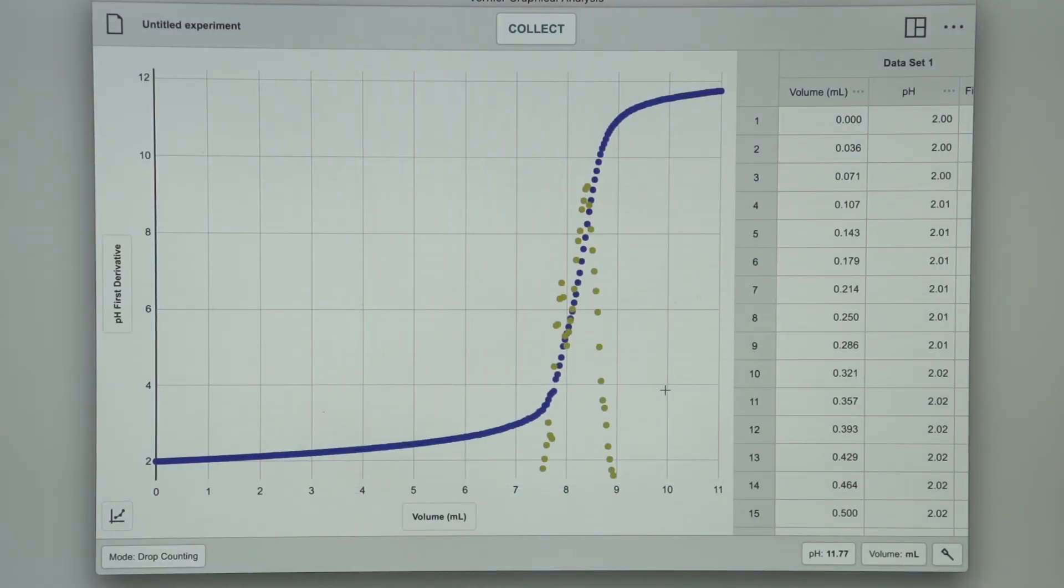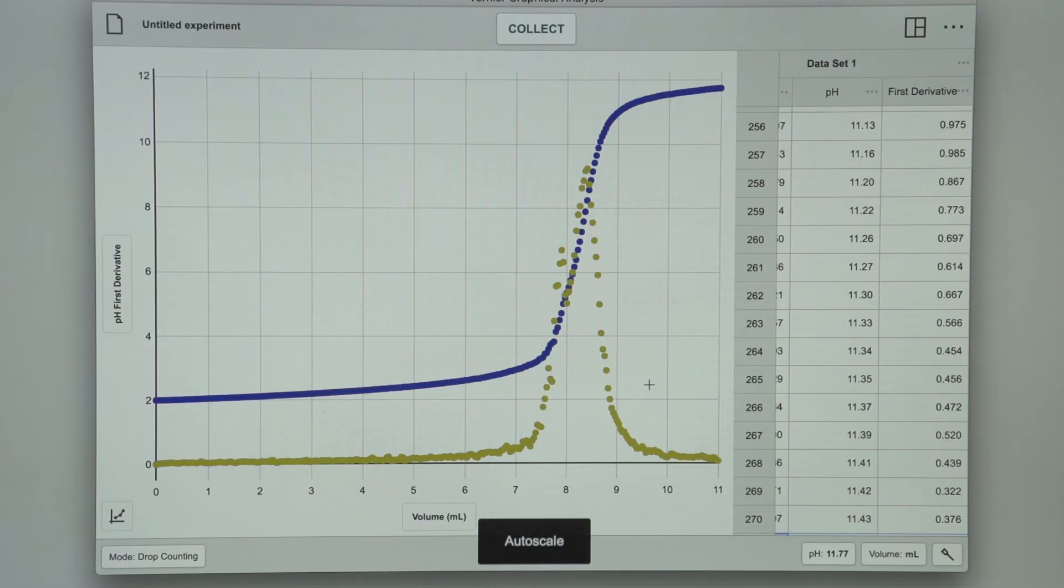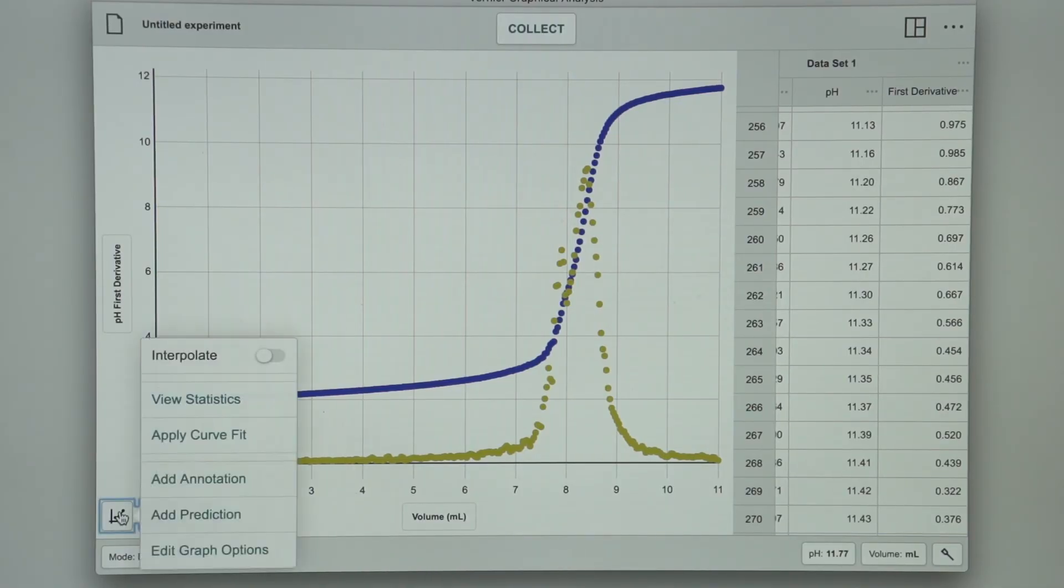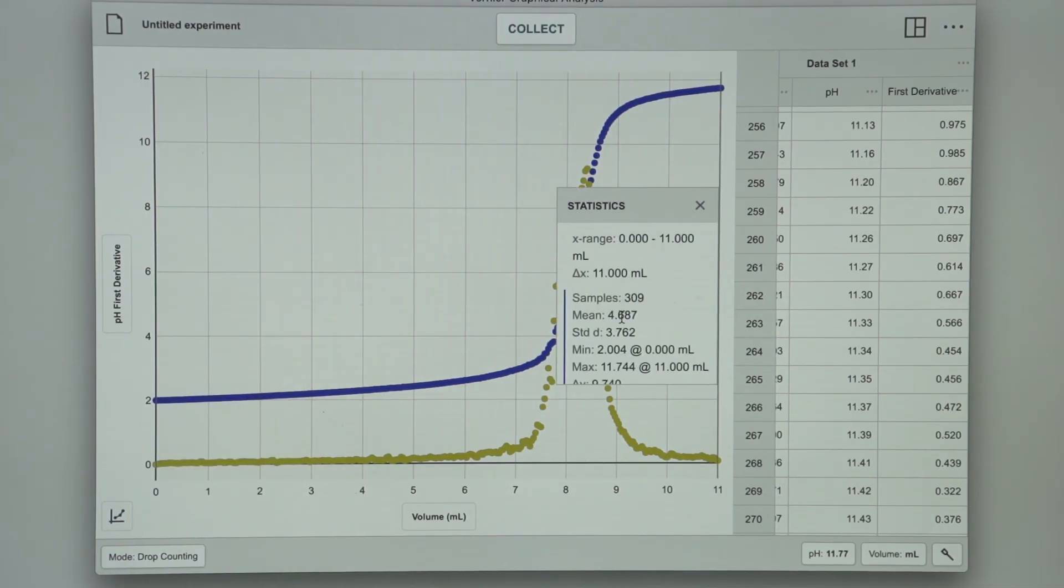To auto-scale, double-click anywhere on the graph. Now, to get the volume where this peak of my first derivative happens, I can use the Statistics feature in Graphical Analysis. To do that, I select the Graph Tools icon, View Statistics, and scroll down to the First Derivative data, where the max is occurring at 8.393 mL.